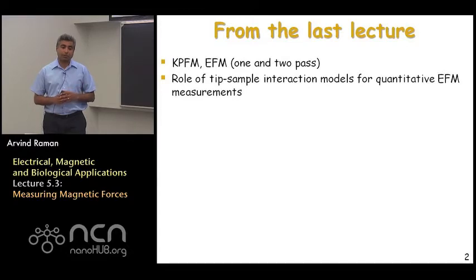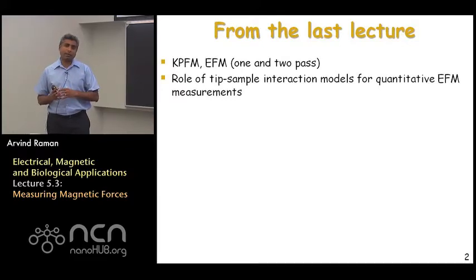And we also talked about the fact that at the end of the day, when one acquires data using whichever EFM mode one is looking at, to really convert what one observes into local properties, you need to have a good model for tip-sample interaction, which gets a little more complicated than all the interaction forces that we have been talking about in part 1 of the class, which was focused on the interaction between the closest part of the tip of the AFM and the surface.